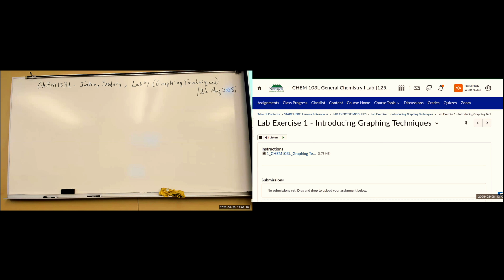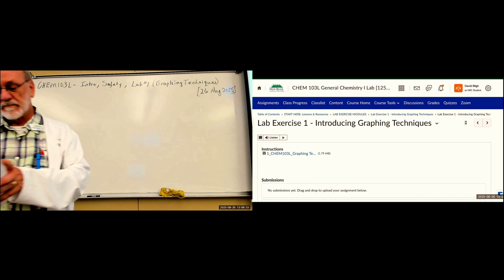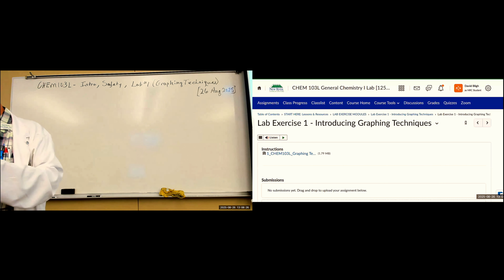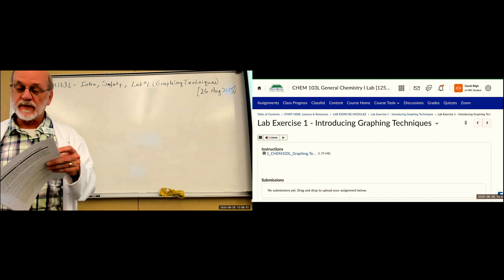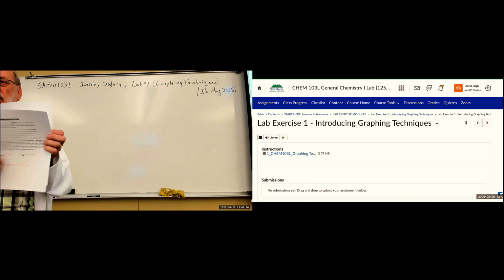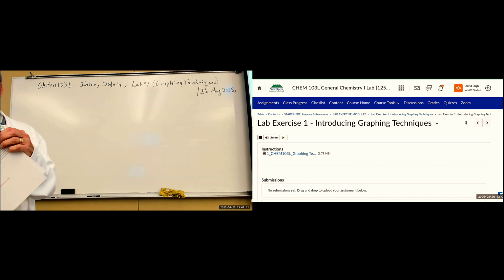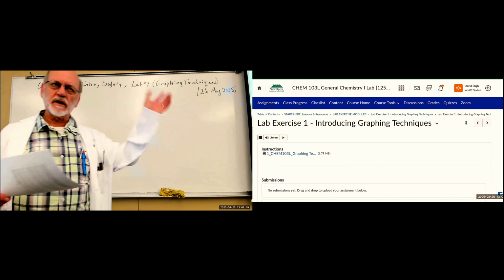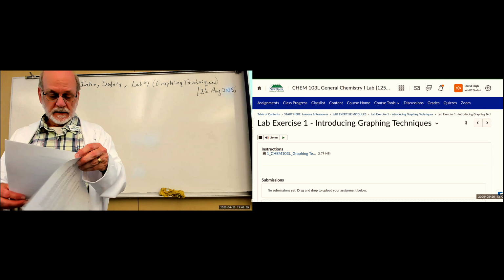So these are general rules. I don't think we need to go over every one of them. You should read them. There are quite a few. Read them so that you know what you should and shouldn't be doing in the lab. And then the last 2 pages are duplicates. Fill out one of them for you and one of them for me. It's like a safety contract. And you can do that between now and the next time we walk in the lab. You don't have to turn it in now unless you want to.